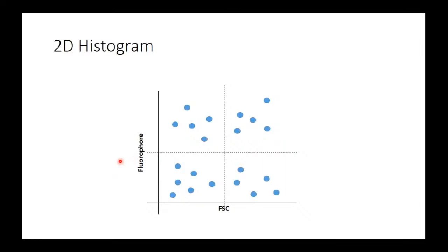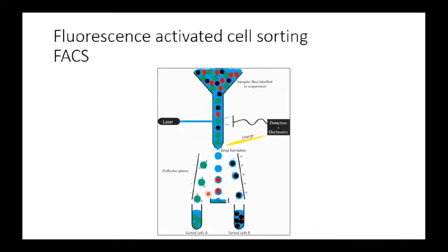Now, what's special about the FACS mechanism, or why is it called FACS? FACS means fluorescence activated cell sorting, which means that this mechanism cannot only give me data about the cell count or the percentage of cells expressing the protein and not expressing the protein, but FACS can also separate the cell mixture into two groups of cells. How does it work? Let's see.